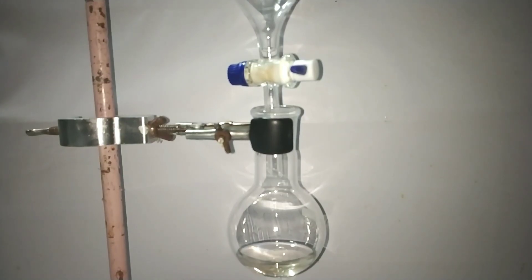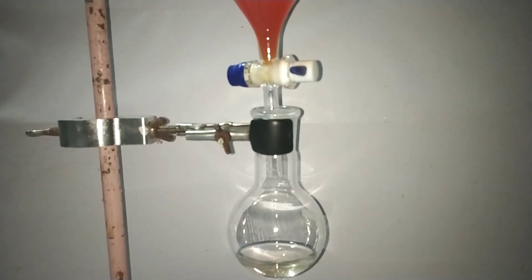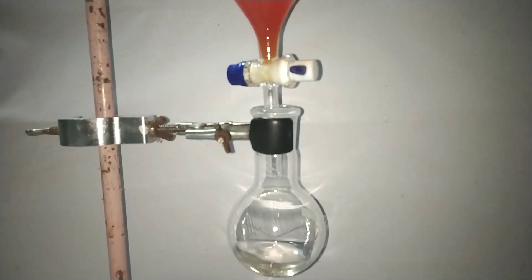Now we set up a separatory funnel on top of the round bottom flask containing the acetanilide and ethanol. Make sure the knob of the separatory funnel is closed.